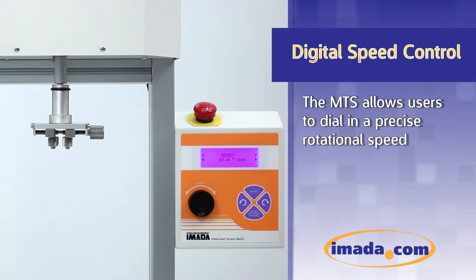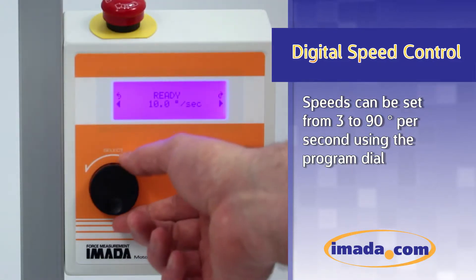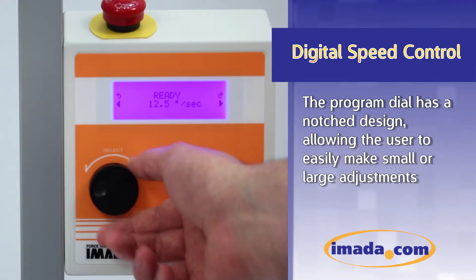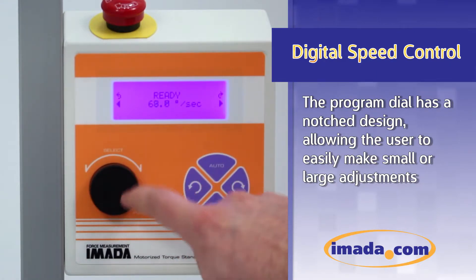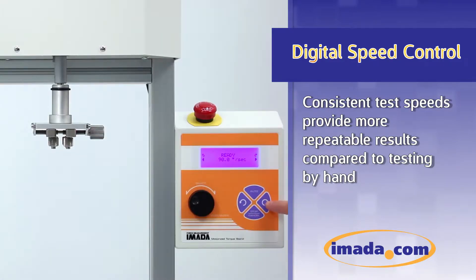The MTS allows users to dial in a precise rotational speed. Speeds can be set from 3 to 90 degrees per second using the program dial. The program dial has a notched design, allowing the user to easily make small or large adjustments. Consistent test speeds provide more repeatable results compared to testing by hand.